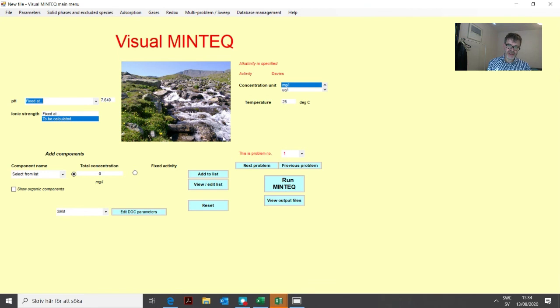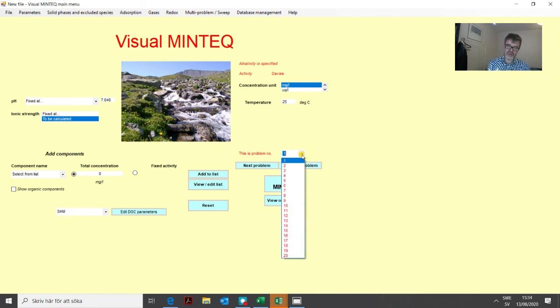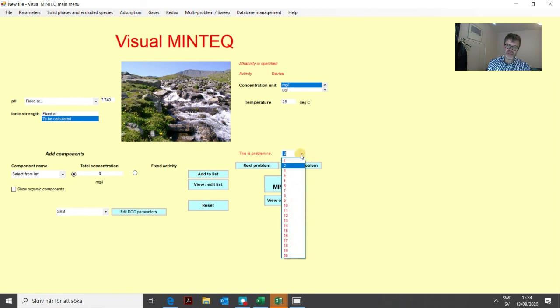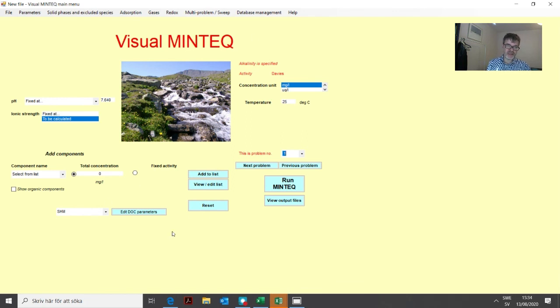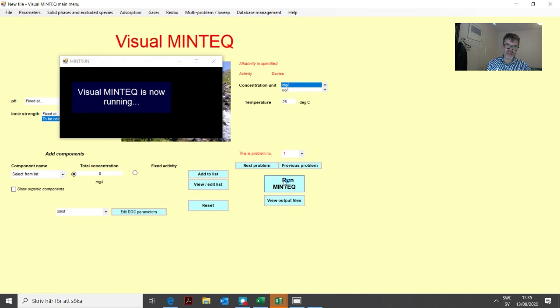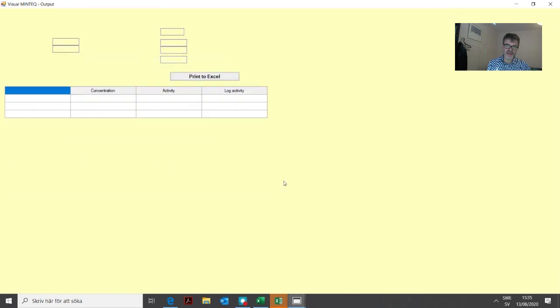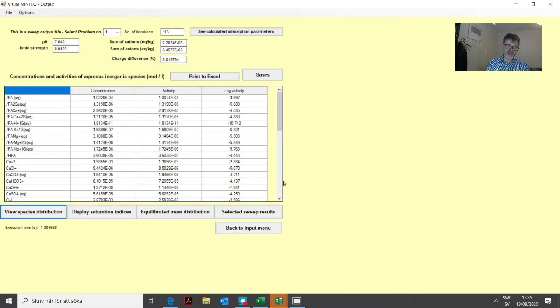Here you can actually scroll between the different problems with this button and see what we have entered. You can change things from this menu as well. But if we're happy with everything we've entered, we just click run MinTeq and it will run all these 20 problems.